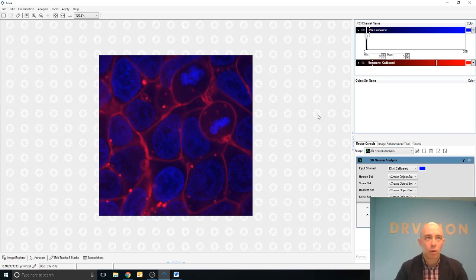It is important to note that these two channels, though they are from the same space and time, act somewhat independently in the software. So we can adjust the overall visualization without affecting the membrane channel while we change this DNA calibrated channel.